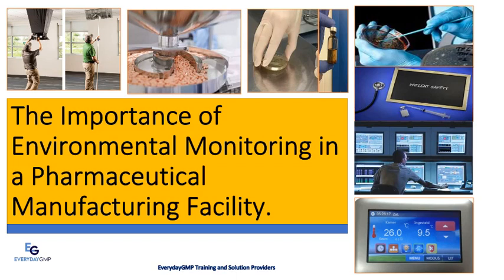The importance of environmental monitoring in a pharmaceutical manufacturing facility.